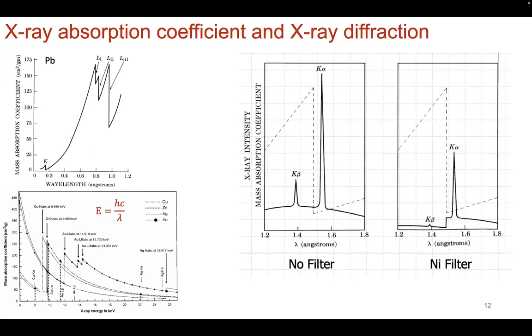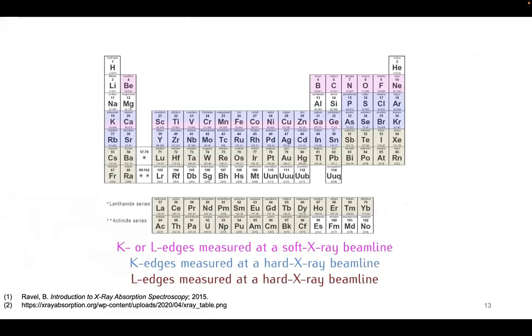So you can utilize the material property to set up your X-ray diffractometer so that you get just signal from the copper K alpha instead of copper K beta as well. Okay. So that's an aside, but that's fun to know, or useful to know.